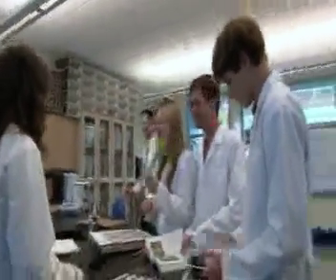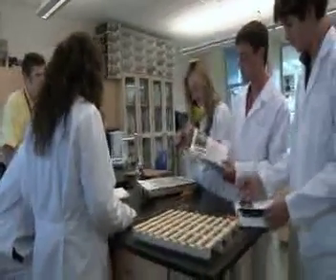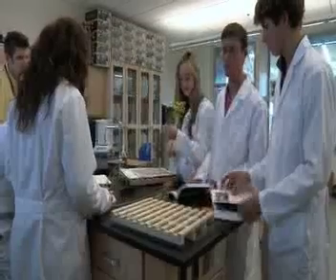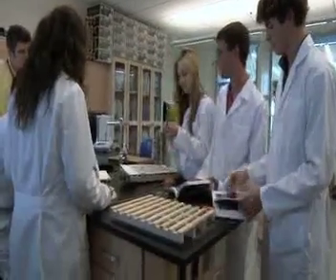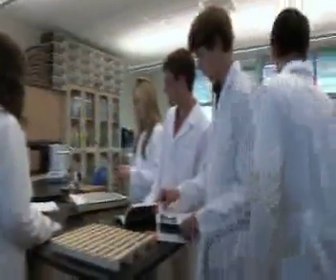One of you folks care to let the folks out there know what you're up to? Brad, Evan. Okay, well, we're just identifying these plants using these field guides we have. Basically, what you're trying to do is match up as many of the physical features of the plant to the book as you can. And this one appears to be goldenrod. And then we are going to be pressing these plants. So, Austin, would you like to demonstrate pressing this for us? Getting it down to a preservable size.